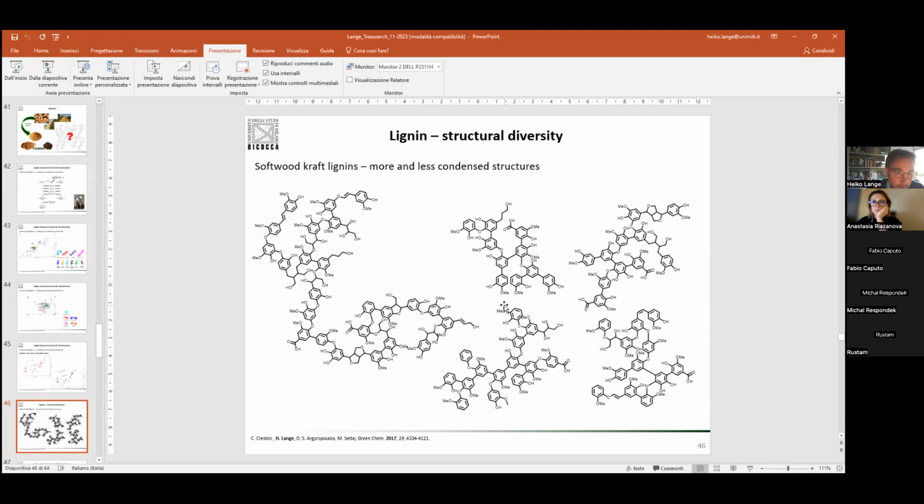We made attempts working on a computer-based description, very flexible, of lignins. If you feed the computer with the percentages of the different inter-unit linkages, it comes up with 10,000 structures that meet the statistical requirements. I was thinking about that. Yeah, it's really amazing. You sit 1 hour in front of the computer, click, click, click, and you see thousands of possible structures that fit your analytical data. That gives you a completely different view of your material, obviously. And that is something very nice, to be honest.